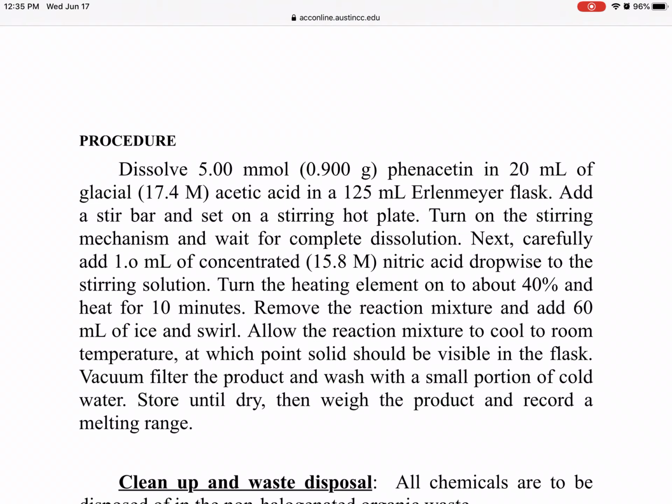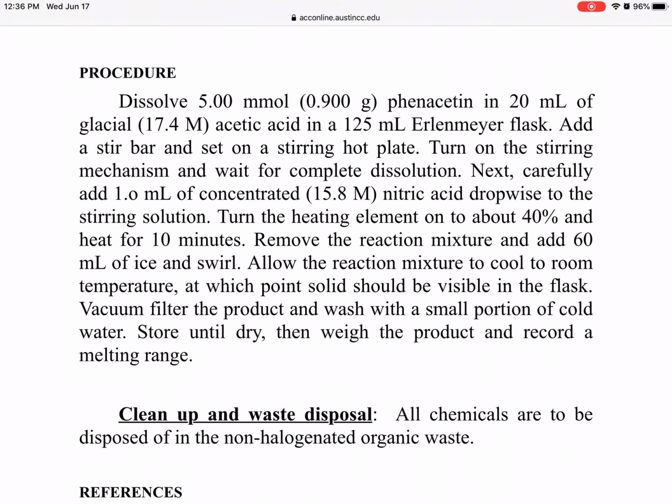The procedure doesn't say so, but normally when an organic chemist does a reaction and wants the pure product, the crude product is not the pure one, because it's right after the reaction has gone to completion. You have a lot of unreacted nitric acid in it, acetic acid, and some other impurities that came along with your original reactants. So most of the time, you recrystallize the crude product. That is the method organic chemists normally use to purify a solid, through recrystallization.